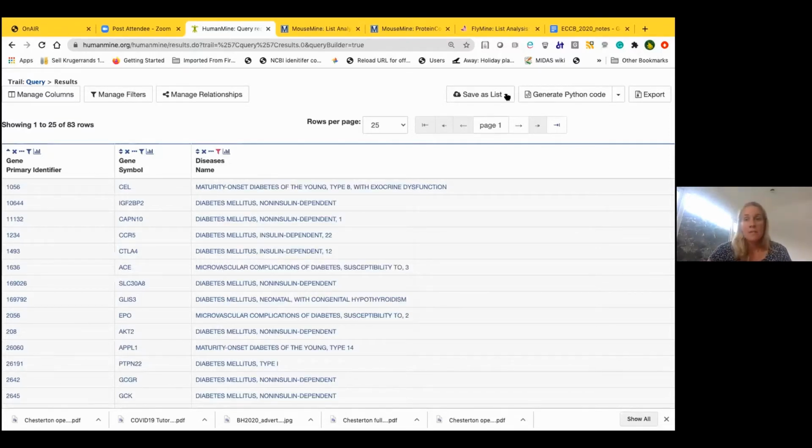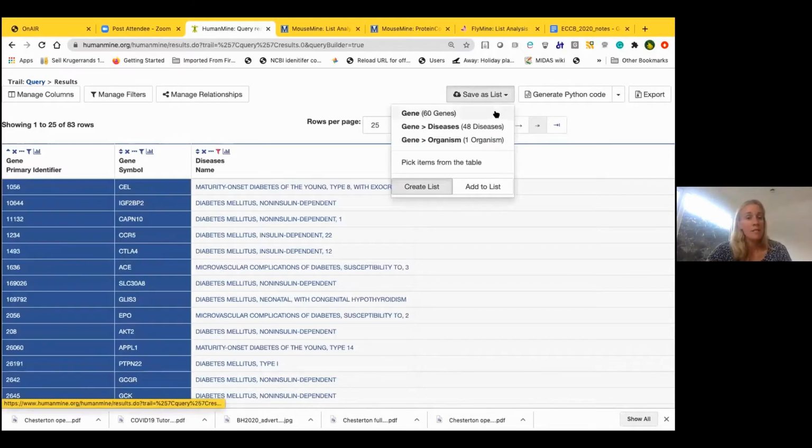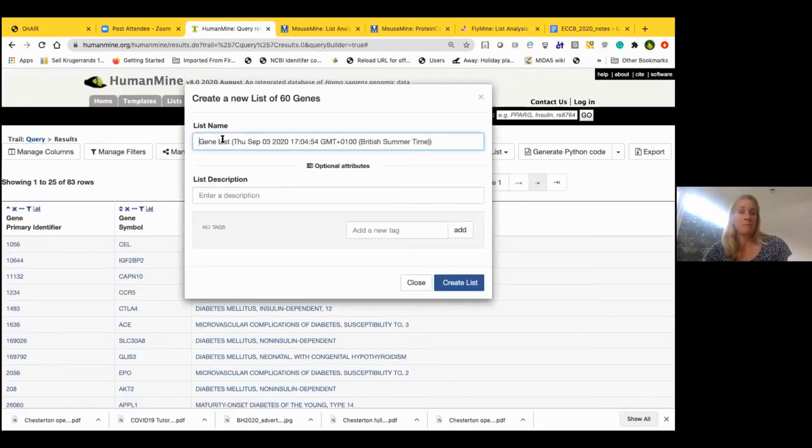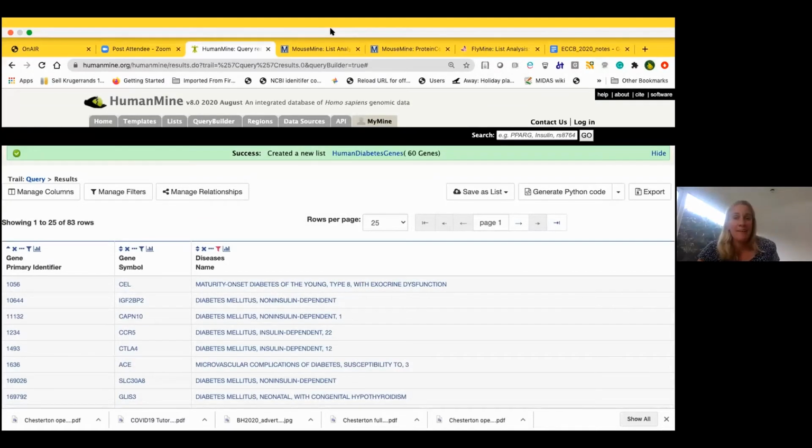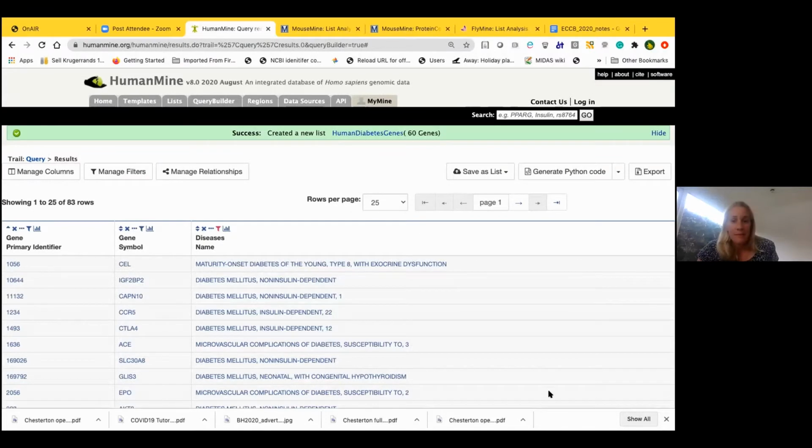I'm going to save a list of my genes involved in diabetes. I'll call it human diabetes genes and create that list. Okay, so that's a very quick view of the query builder. Hopefully that wasn't too quick. Go back to my slides.